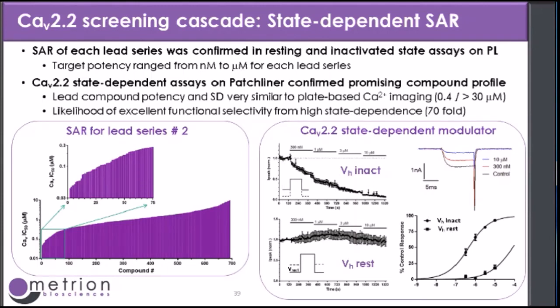It's also really important to note how stable this assay is. For a calcium channel, that is an amazing achievement. I had very little to do with this. Obviously, this kudos goes to all of the people involved in setting up and running this assay. There's a lot of work that goes on behind being able to show a nice steady state calcium channel recording like that.